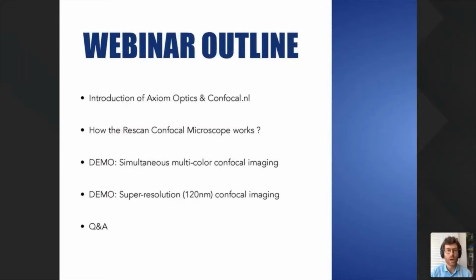Here's today's webinar outline. I'm going to start with a very quick introduction of Axiom Optics, and then I'm going to give the hand to Jeroen, who is going to present confocal.nl and then explain how the Re-scan confocal microscope works, and especially what is the trick behind the resolution enhancement. Then we're gonna jump to the demo session.